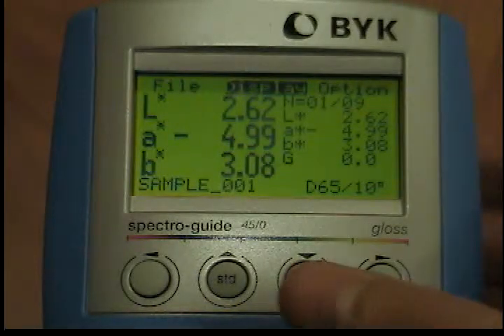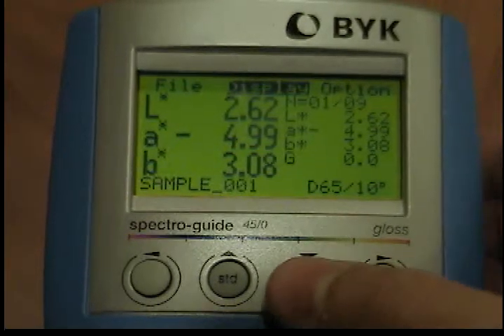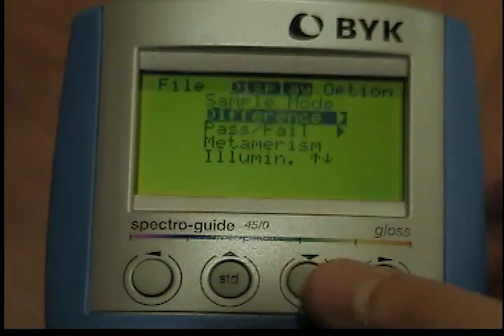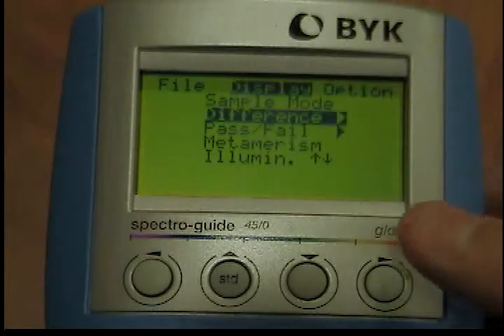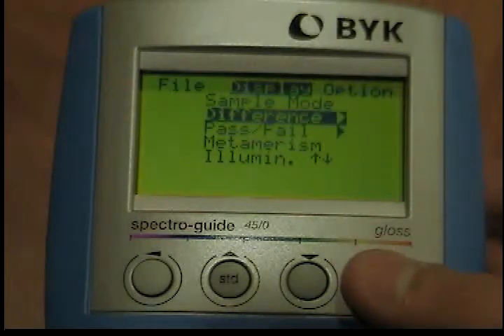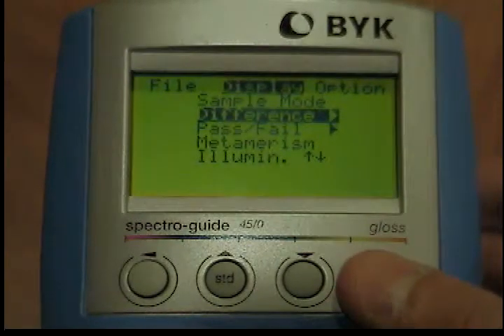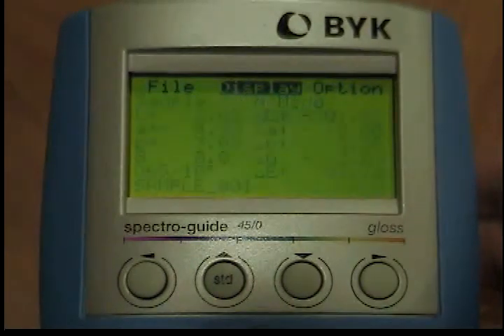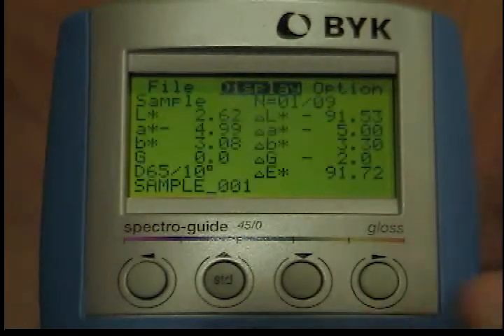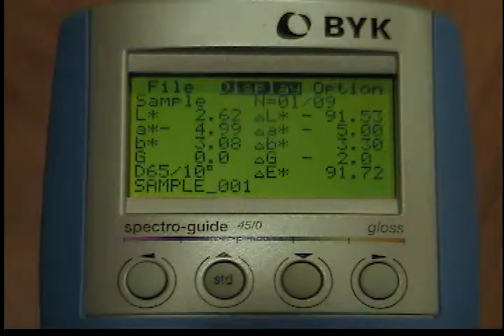To get to difference mode from the display menu, use the down button to move the cursor to the difference option. When you press the operate button, the display changes to difference mode. The data is displayed in accordance with the selected display setting.